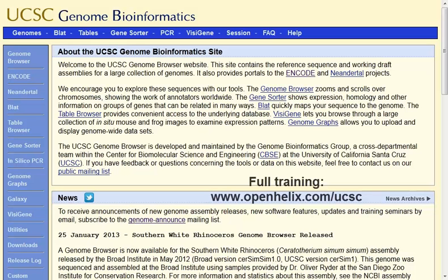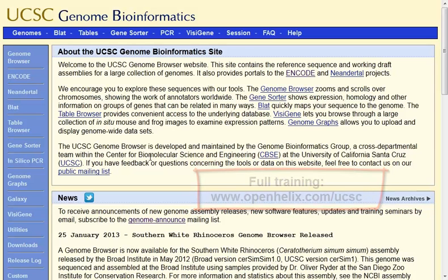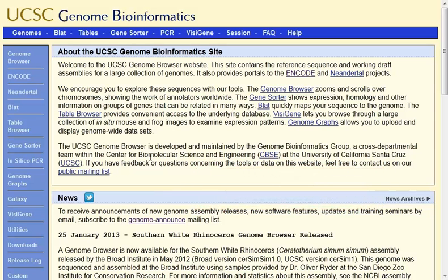Now if you want more training on the UCSC Genome Browser, we've got complete training available, and you can go to our site and access the full training. But today I just want to show you one specific track to give you a little bit of information that you might not realize.